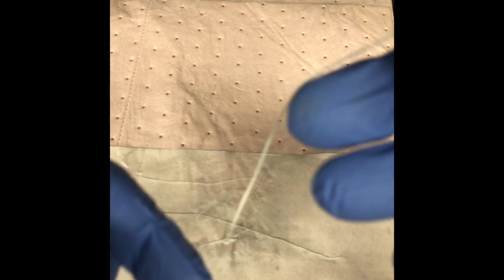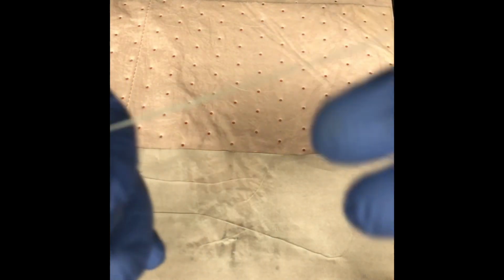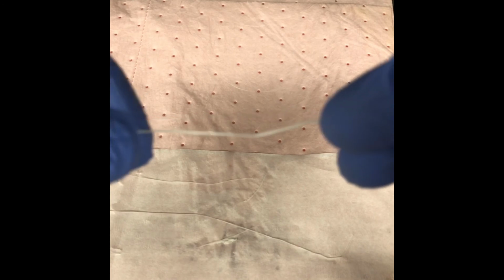It's hard to do in this camera. It's like trying to cut your hair in the mirror, right? Okay, so if I hold the strand and focus the camera on this strand, you can see it's beginning to stretch, right? And as it gets drier and drier, it's able to stretch more and more.